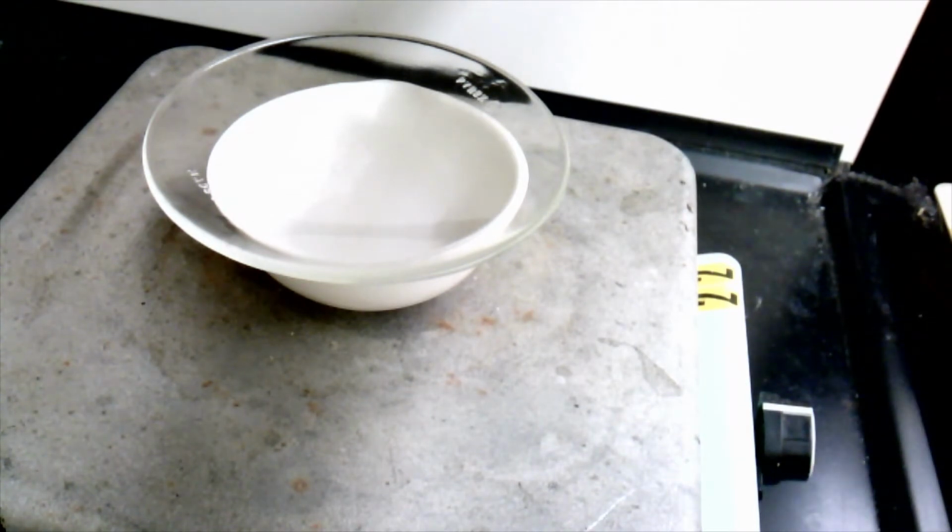Okay, we're going to wait for all the HCl solution, all of the liquid, all of the water to evaporate, and then we're going to take our final measurements for procedure A. Okay, so let's move on to procedure B.